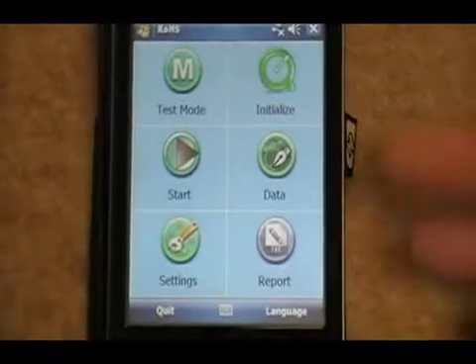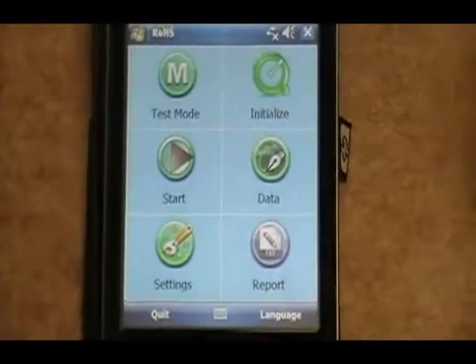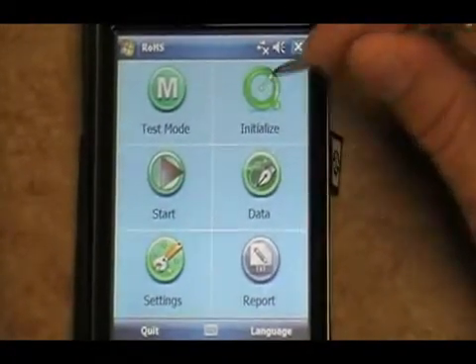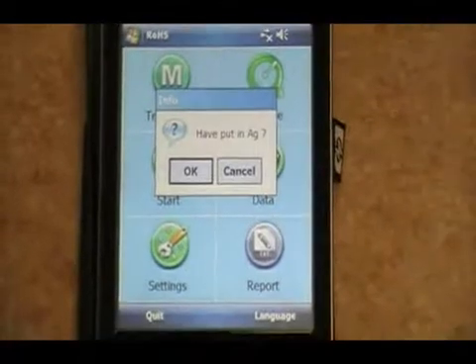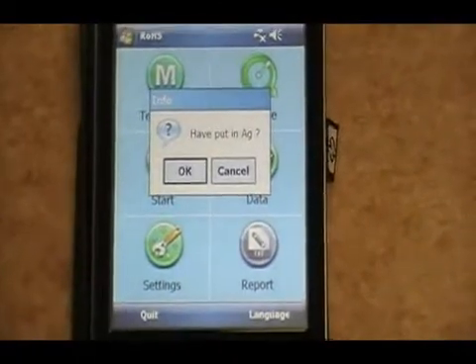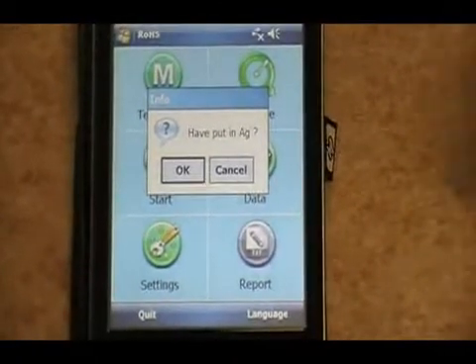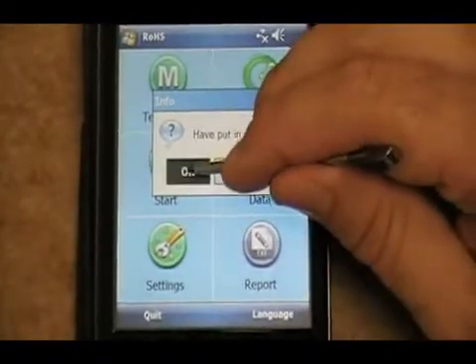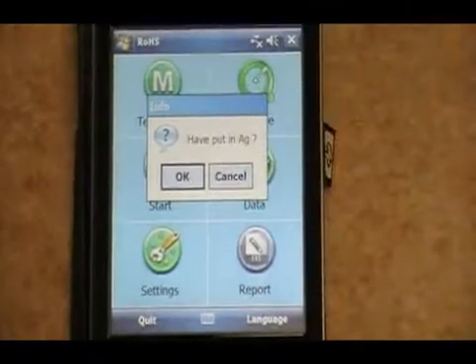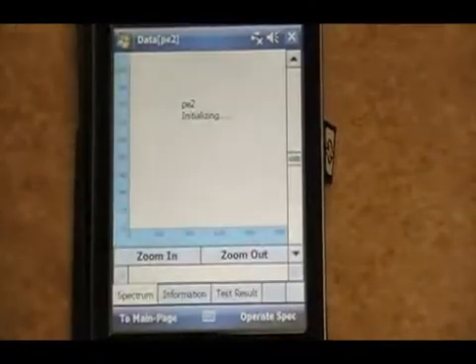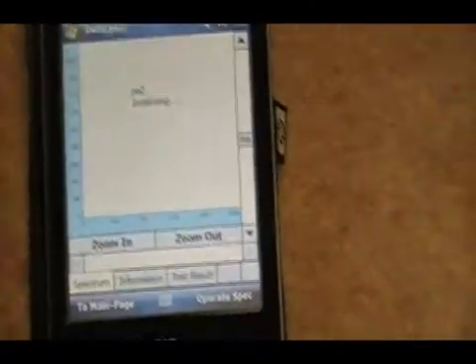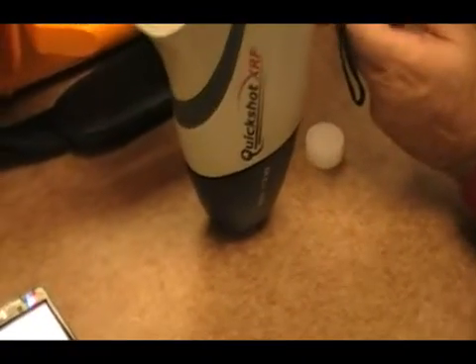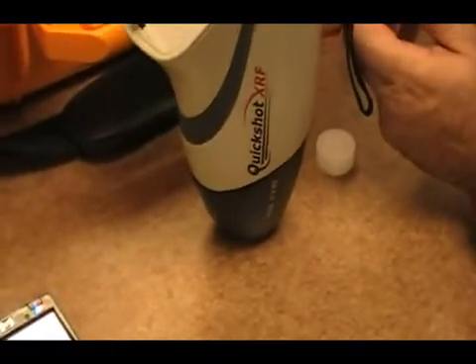Once it loads, it comes back to the main screen. You then need to initialize that specific method. It asks you for the silver. You'll hit OK, and have approximately 5 seconds, bringing the laser down onto the part, covering the silver.